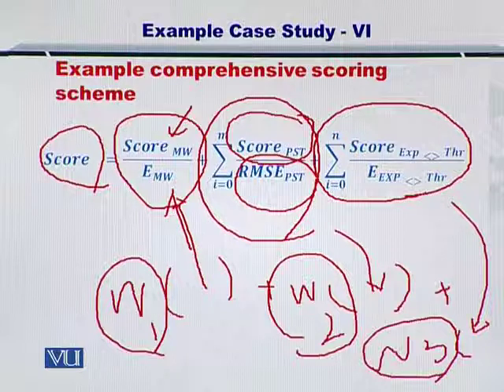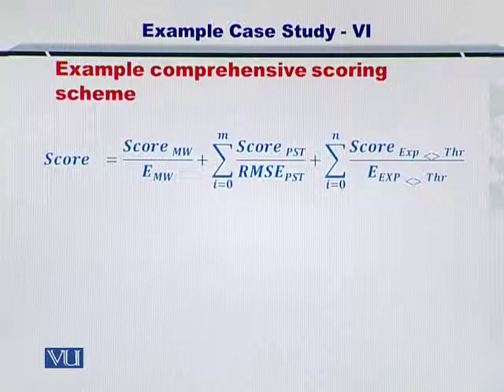So the protein that we were discussing can be measured for its scores coming in from each one of these elements, and then you can weigh each element by looking at the quality of the spectra at MS1 level or the quality of the spectra at MS2 level, and so on and so forth.